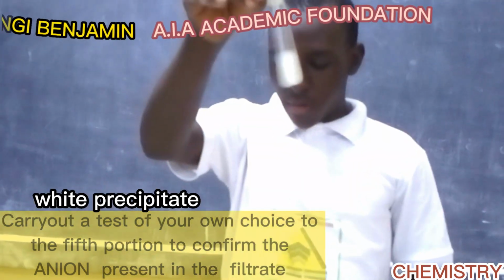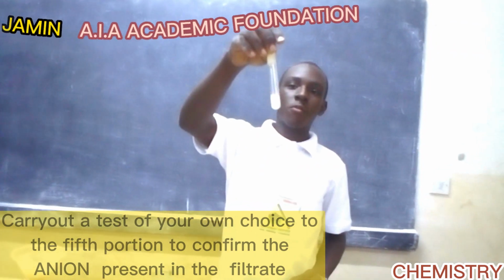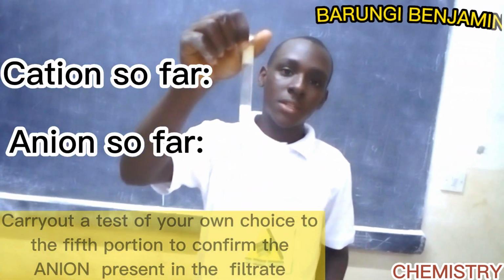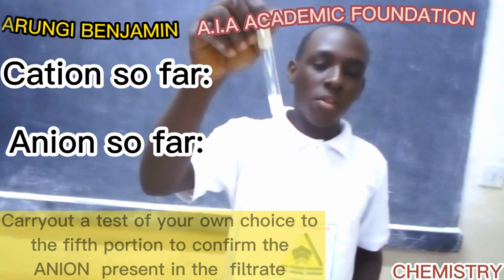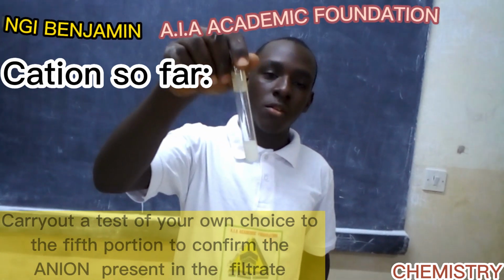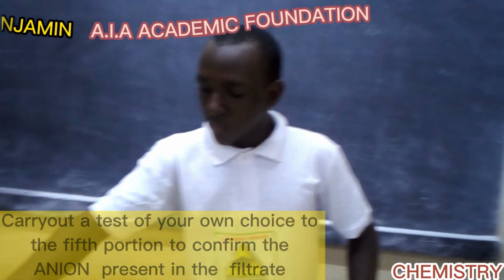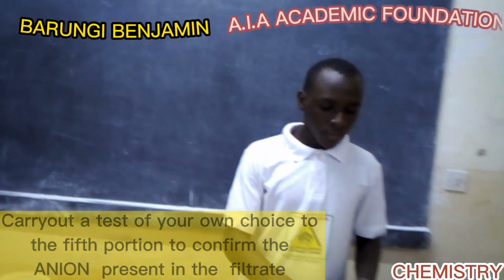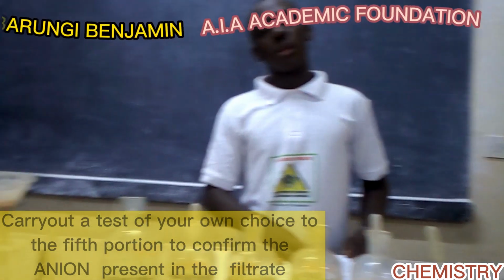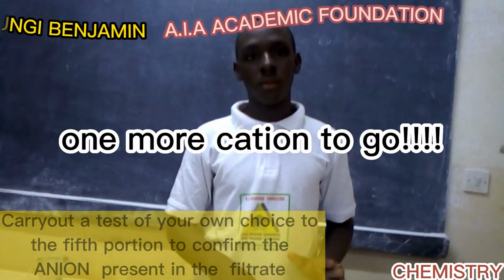We shall write sulphate ions confirmed present. So we have confirmed so far 1 cation and 1 anion. The first cation we confirmed was aluminium 3 ions, and the anion we have confirmed is sulphate ions. Like I said, we are going to confirm 2 cations and 1 anion.